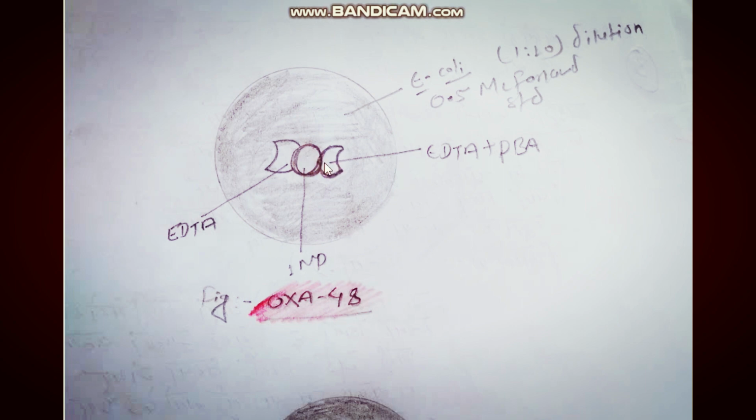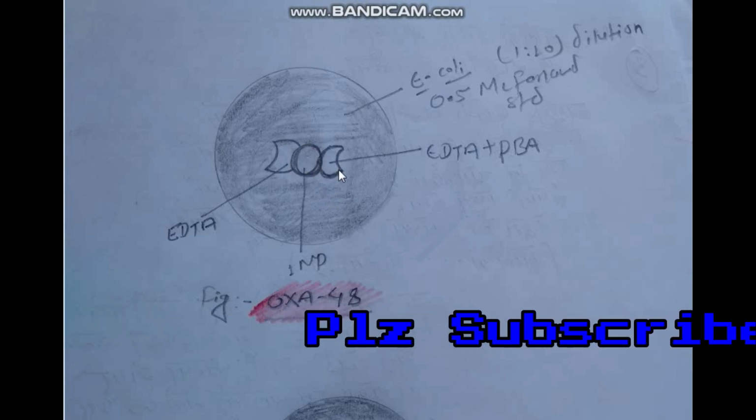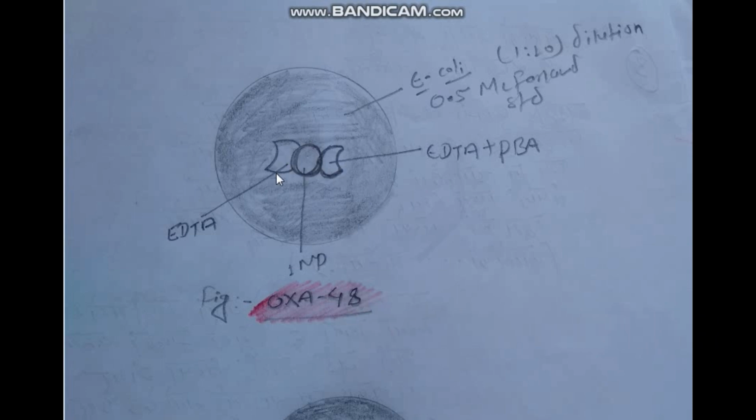By touching the top of well-isolated colonies, 2 to 3 colonies of the tested microorganism were applied to coat the disc containing EDTA and EDTA plus phenylboronic acid. The inoculated discs were placed with the bacterial inoculum side down on the lawn, adjacent to the imipenem discs.